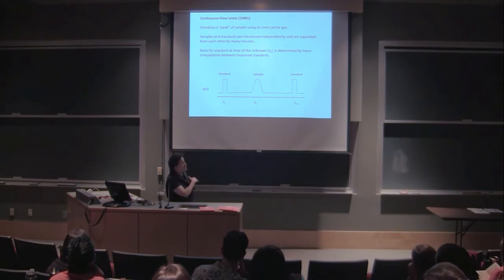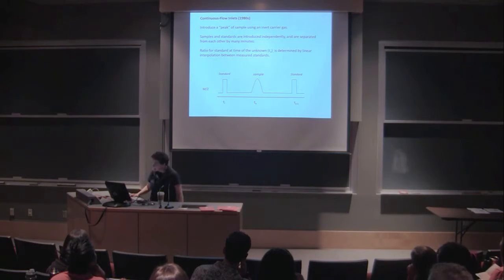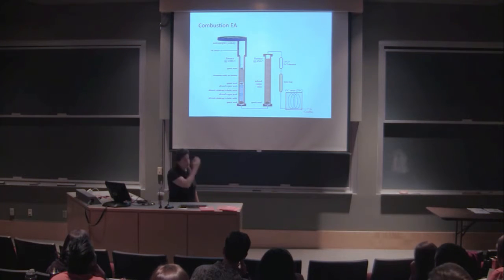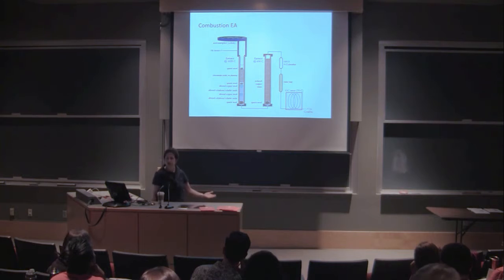This technique of continuous flow technology is applied in a variety of inlet systems. Probably the most widely used, at least on the organic side, is not GC systems, but EA. EA systems, there's way, way more measurements by EA internationally, globally, than by GC techniques. So this is really the most successful of the continuous flow technologies.